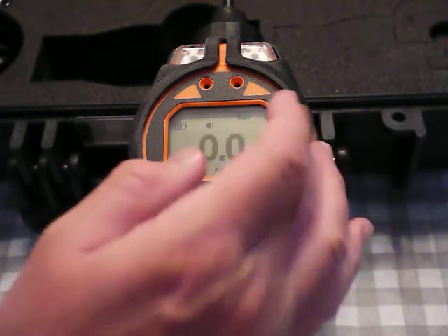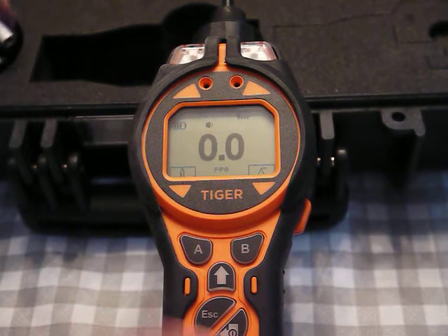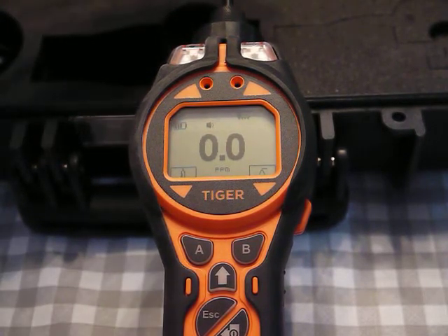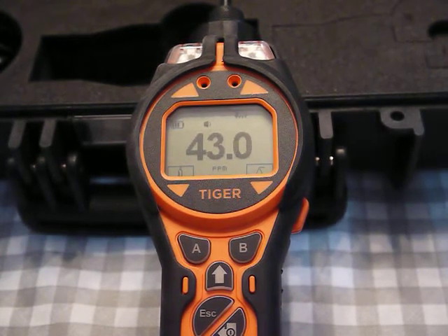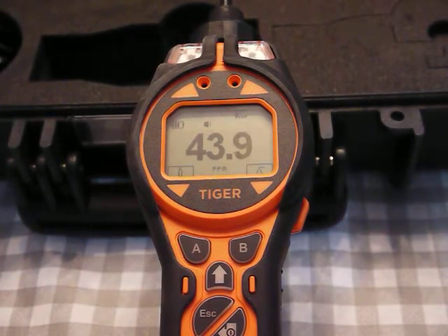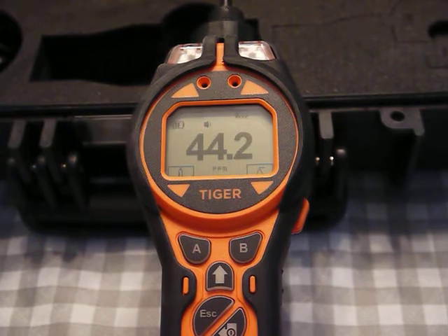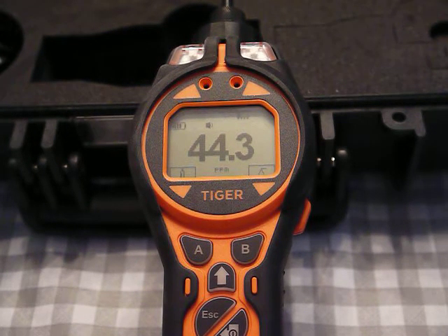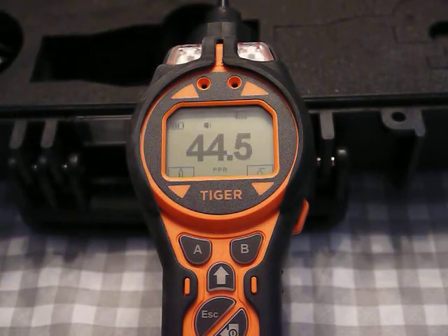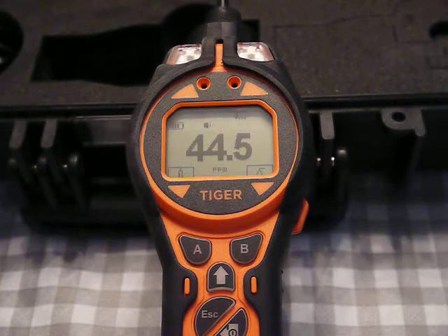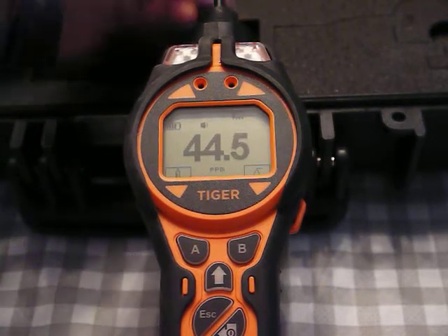You can see I hit enter and a little check mark went in there. Let's put 100ppm isobutylene on the unit and see what it shows. This is 100ppm isobutylene — normally if this was set to isobutylene with a response factor of 1, it multiplies by 1 so you get 100ppm. But the response factor is 0.45, so multiplying 100 by 0.45 gives you 45 basically. We're pretty close here, and this shows how the response factors work.